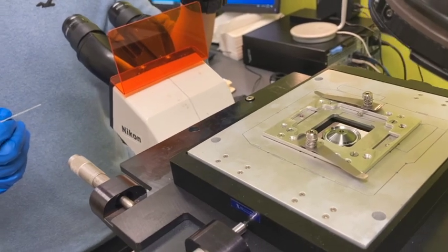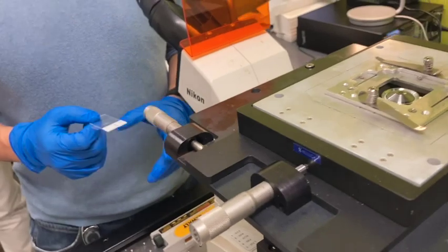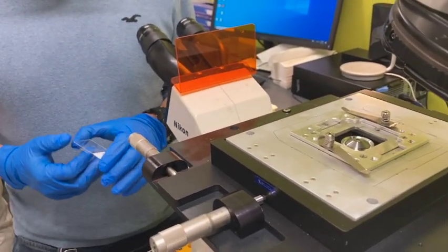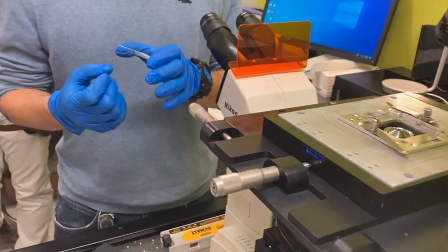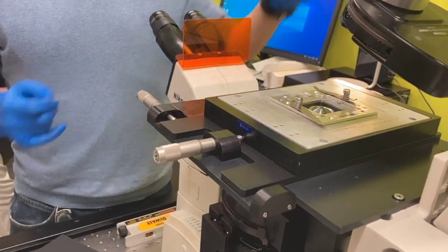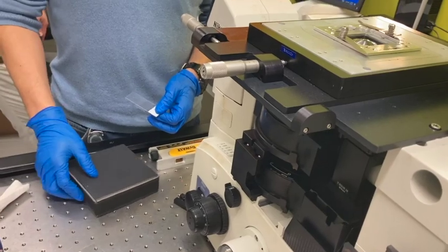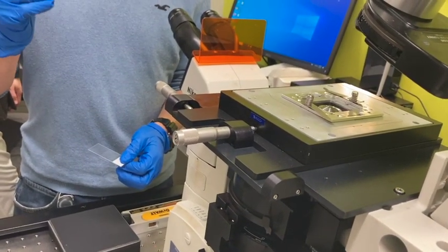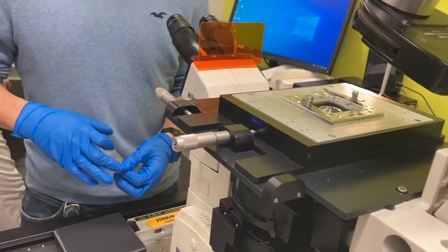I think it is. Or something like that. The hardness is very high. Yeah, exactly. Which means only a material of comparable hardness will make a scratch on the surface. You are not going to make a scratch on this metal with your finger. It's like when you cut glass, you need a very special diamond knife, because the hardness is higher, so you can make a scratch.